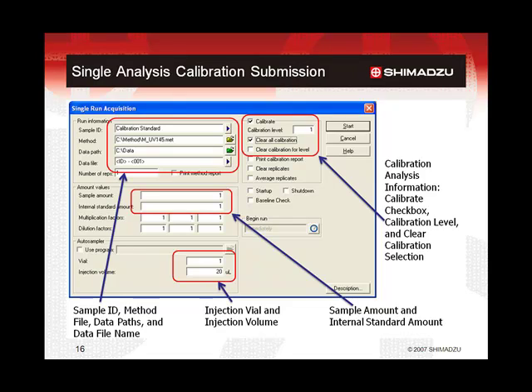Selecting 'clear all calibration' will clear out any calibration data that may have already been in the method, allowing the data to be automatically re-entered as the standard samples are analyzed. 'Clear all calibration' should only be selected for the first standard of a calibration set; otherwise, the calibration will only contain data for the most recently analyzed standard. The 'clear calibration for level' option can be selected for all standards as it replaces pre-existing calibration data one level at a time after each level has been analyzed. In this way, the method is never completely cleared of the calibration data.